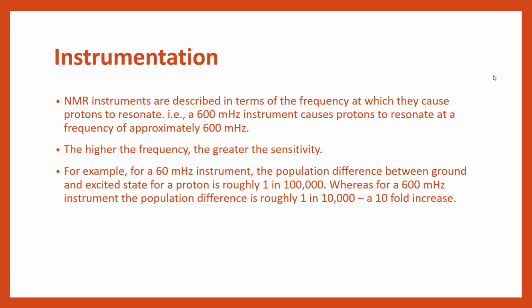And that makes a marked difference when you're doing any form of sample analysis, again, particularly as your spectra get more complex and as you're dealing with compounds that are maybe rarer, higher value, or again, maybe lacking certain characteristics such as solubility.